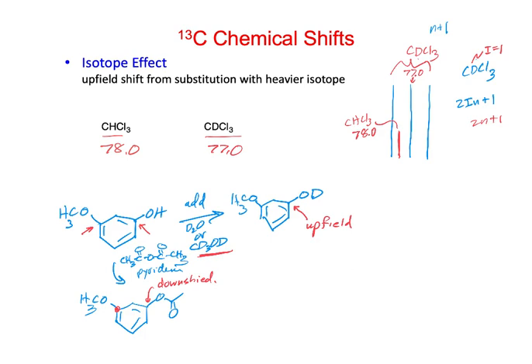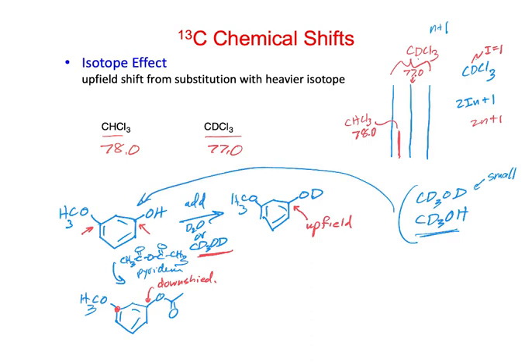So you could actually run one C13 experiment in, say, a mixture of CD3OD and CD3OH, so you could have a small amount of this in order for the NMR to lock on that signal. No, what am I thinking here? Yeah, so if you did it this way, then this would be for this experiment over here. And then in here, you would just do it in deuterated methanol, right? So the solvents are almost just the same. And so you wouldn't see solvent effects, but you'd see a deuterium exchange effect. All right.